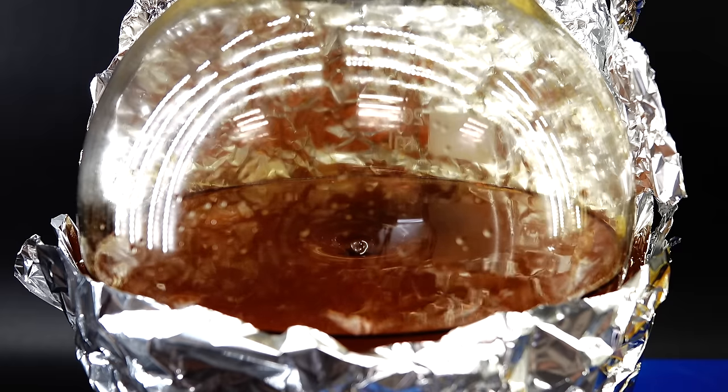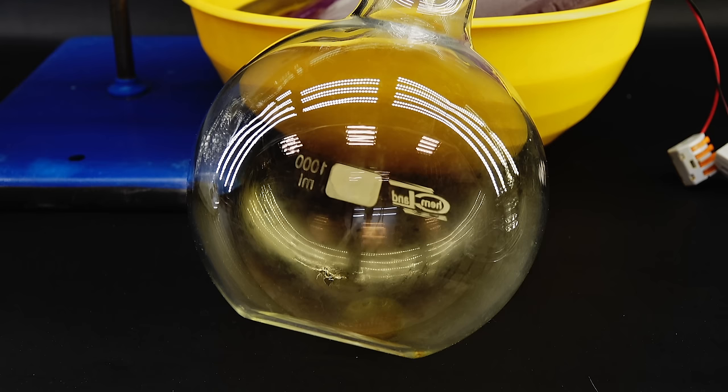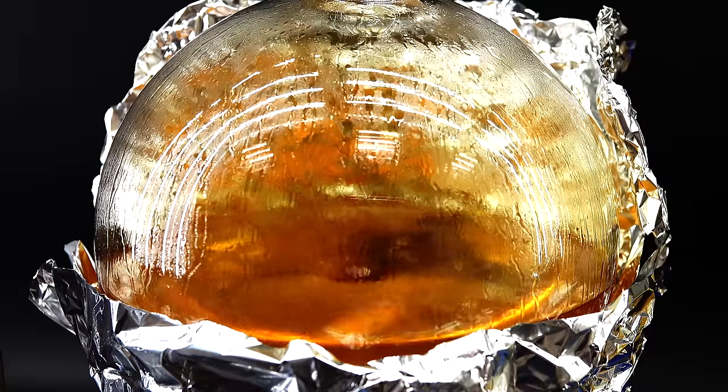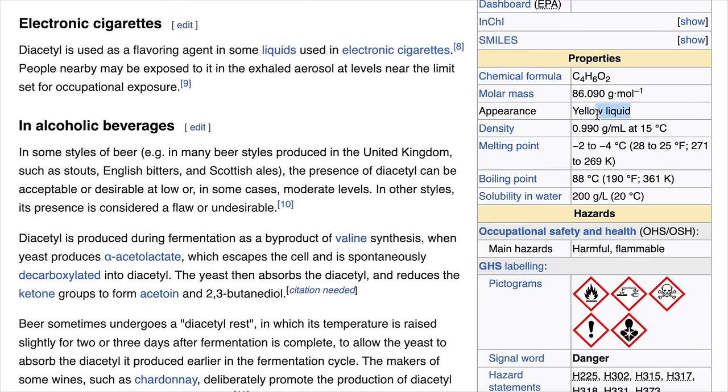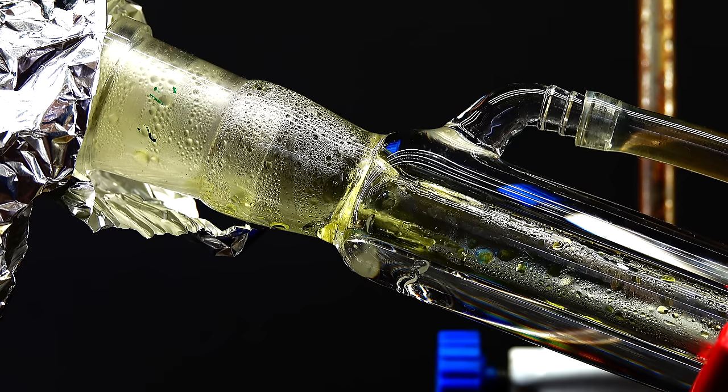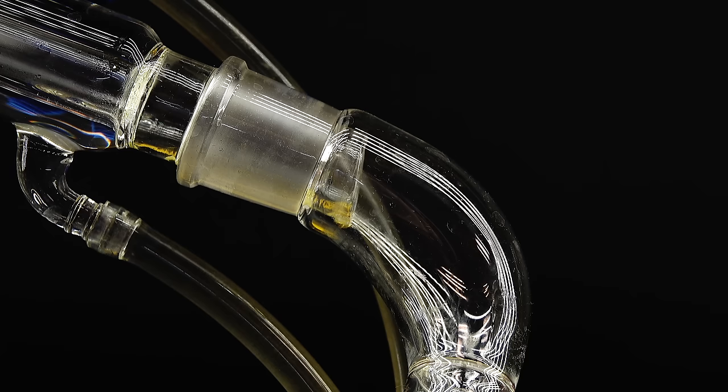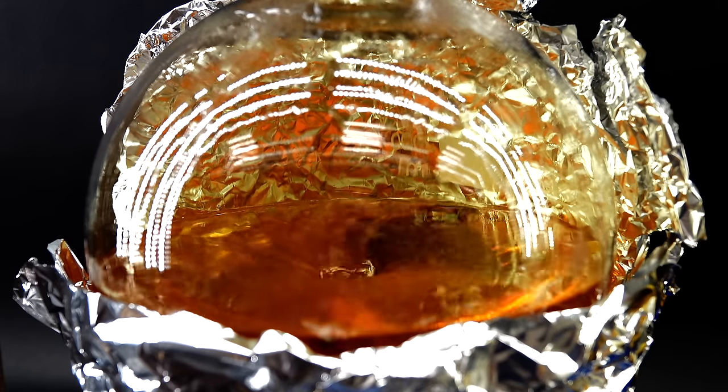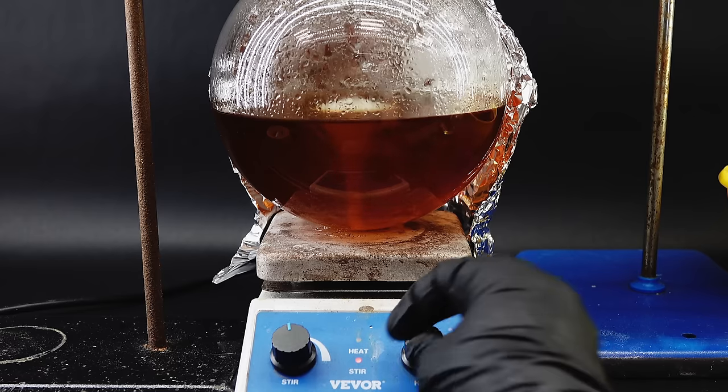Fortunately after about half an hour some vapors started escaping into my condenser, and at first I thought that this was just some water but instead this yellow liquid started collecting in my receiving flask. At first I thought that this must be some impurity or a byproduct since in organic chemistry yellow almost always means that you messed something up, but in this case it for some reason is the color of my target product. I was really surprised when I found this out and thought that it's quite cool for a butter flavored chemical to even look like molten butter. Anyway I continued distilling the reaction mixture, at first collecting just diacetyl which because of its low boiling point came over before any water. At some point however some water also appeared resulting in this quite cool effect in the condenser, and when there was no more diacetyl condensing I turned off the heating and let the boiling flask cool down.